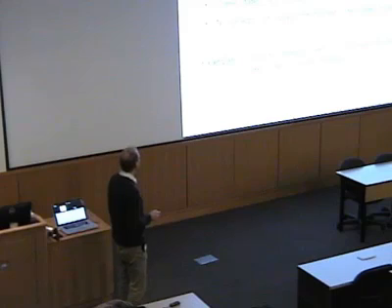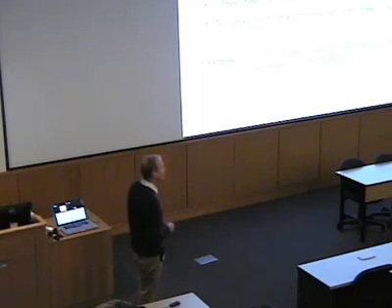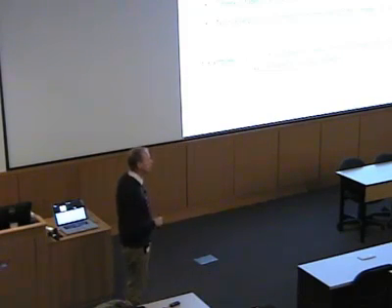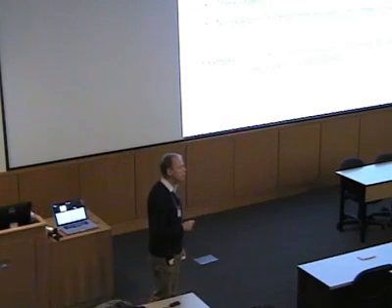And so usually there's redox chemistry going on. The metals are changing their oxidation states very often, as part of the function of the enzyme. And in many, many cases, the redox states are paramagnetic, where you perhaps have a high-spin iron or copper, which goes through a paramagnetic state. And so these can be measured using EPR spectroscopy.